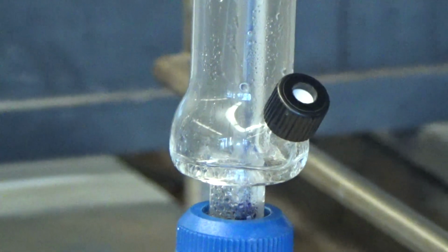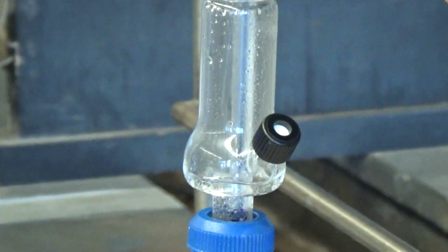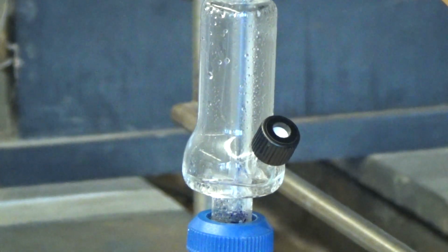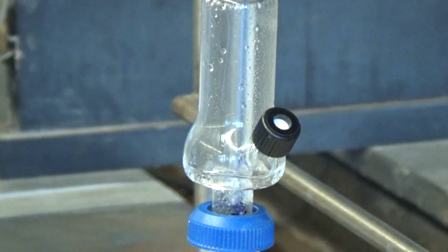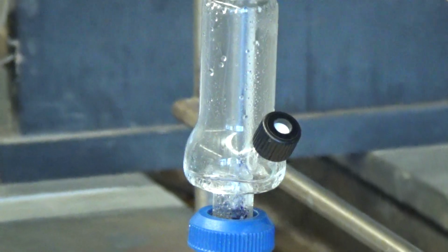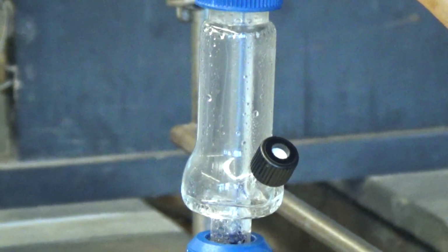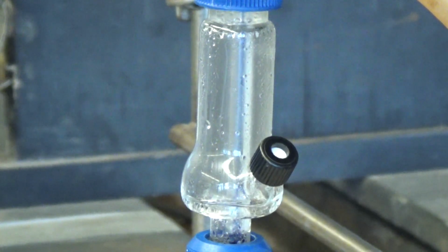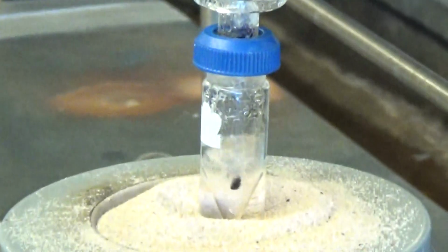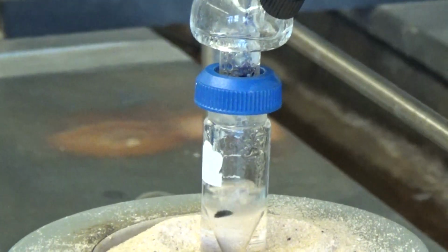Except acetone, other ketones do not smell good. Ketones, they have a bad smell. I love the smell of acetone. Acetone's pretty cool. Acetophenone, not really. 2-butanone, or is it methyl ethyl ketone? That's okay, that's like acetone. But this is a ketone too.